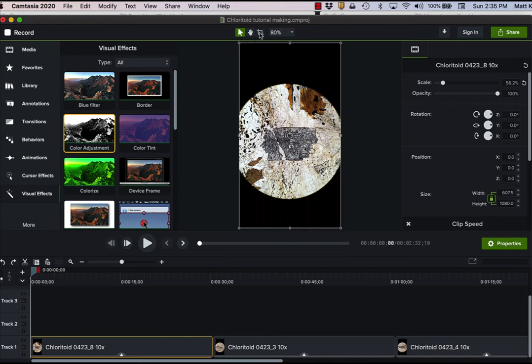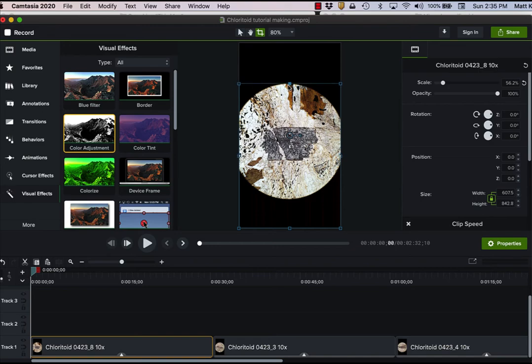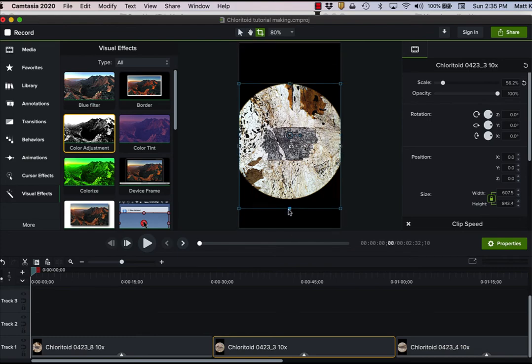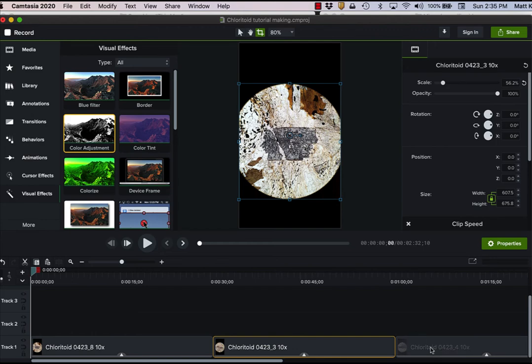What else do I have to do? I have to resize all of these. So I don't need any of this extra material out here. And so I go through and resize, or not resize, crop each of these.